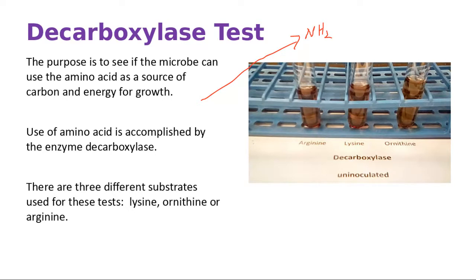What is that, ammonia? It's an amino group, but you're right, it's not happy. And so immediately, this is an amino group. It immediately is going to pick up another hydrogen. It's going to be ammonia.